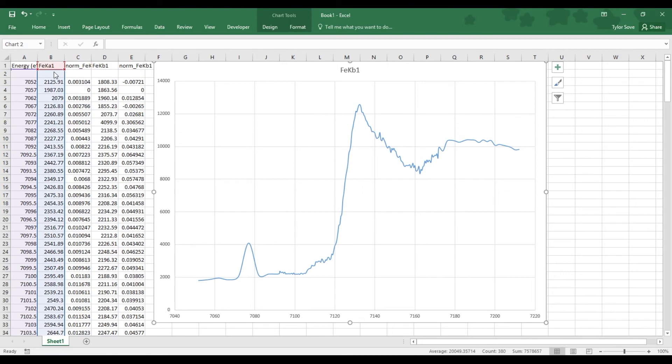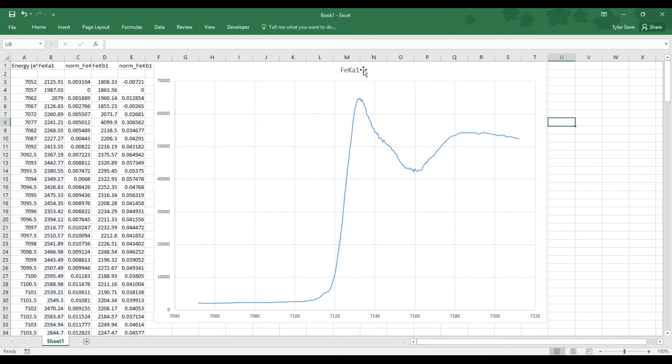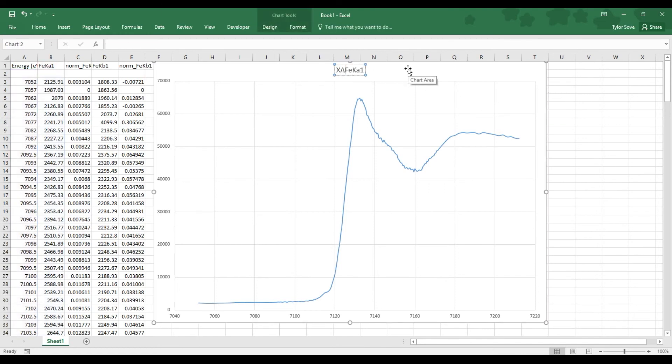And so going back over to the K-alpha, we can see here that this graph is fairly complete. The only thing that we're missing is a rigorous title, and in which case choose a title that is appropriate, that basically lets us know that this is a XANES measurement on the iron K-alpha. And then you'll want to follow this up with your sample name.